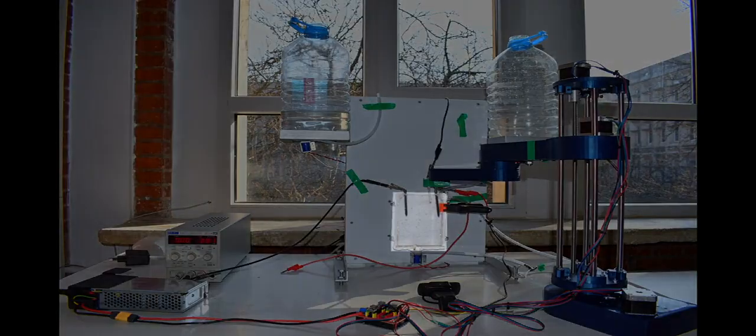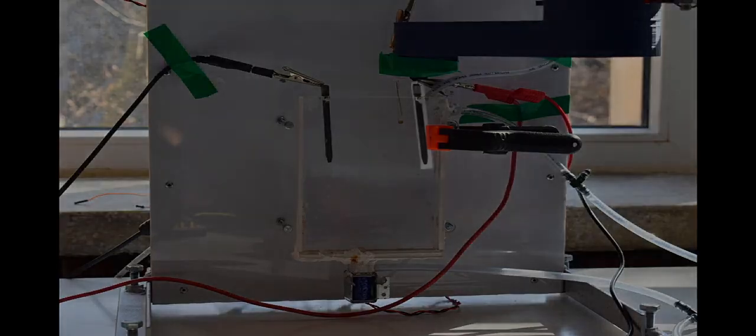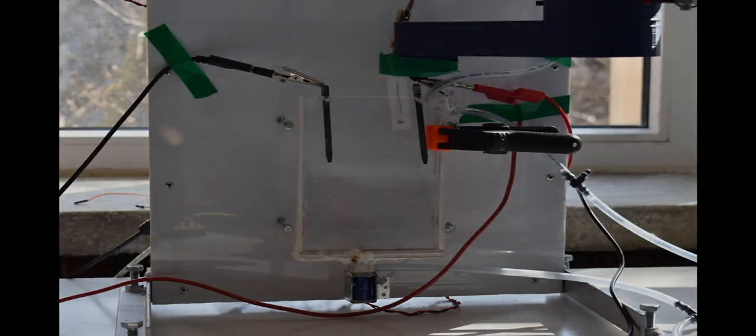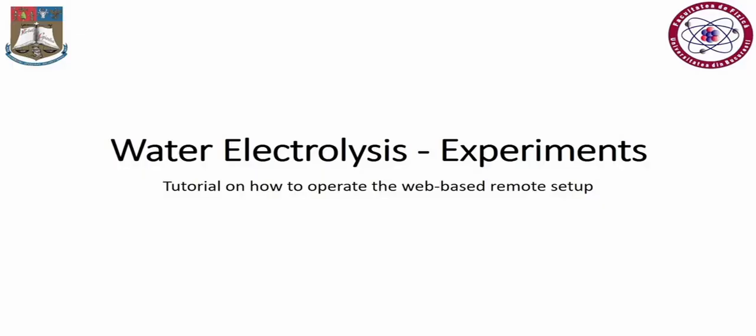Highlighted here we have our PSU, the power supply unit, the distilled water container, the electrolyte container, the robotic arm, and the reaction container. In the reaction container we have our working electrode, counter electrode, and reference electrode, all sitting in the electrolyte solution. This builds upon the subjects already discussed in previous presentations.